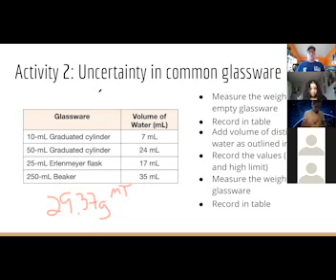So then I want to put 24 mils of water in it. So again, I don't want to make a big mess, so I'm going to use my transfer pipette. Each time it transfers about 3 mils, or you can just pour it up to 20. That's fine.